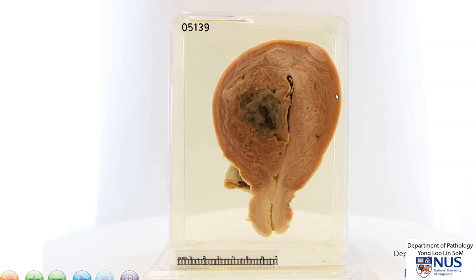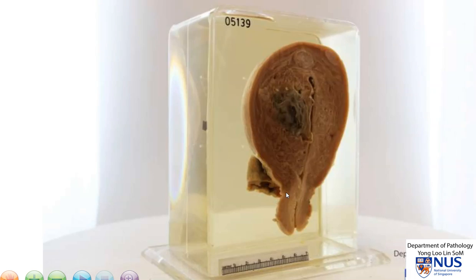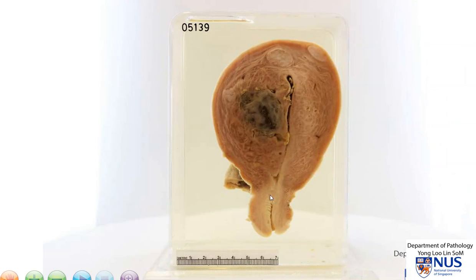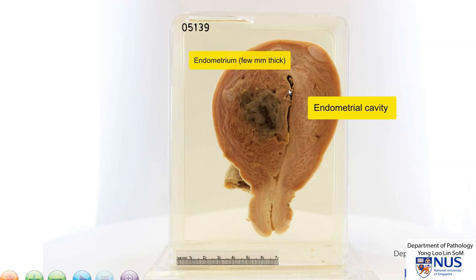This is a pathology specimen showing a bisected uterus, bisected longitudinally in the sagittal plane. What we're looking at on this surface is the endometrial cavity, the endometrium, the myometrium which is thickened, and this is the uterine cervix.